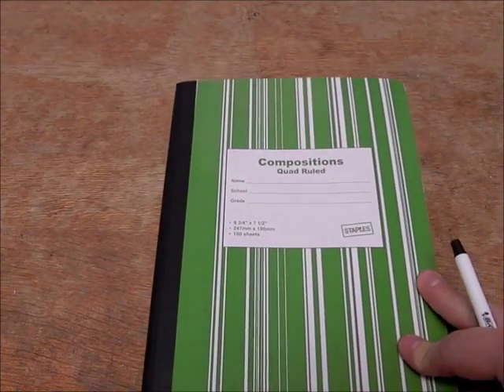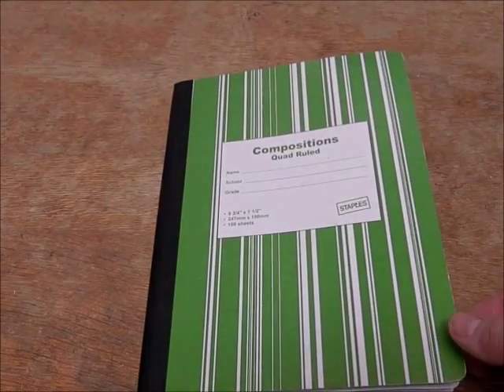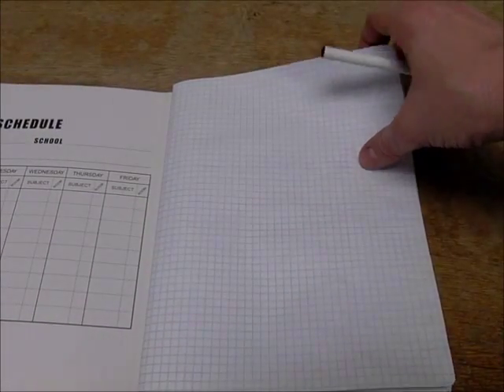This is the composition notebook. It's quad-ruled. It doesn't necessarily have to have this wonderful green stripe on the cover, but it does have to be a composition notebook in which the pages are sewn in, and the pages themselves are graph paper.